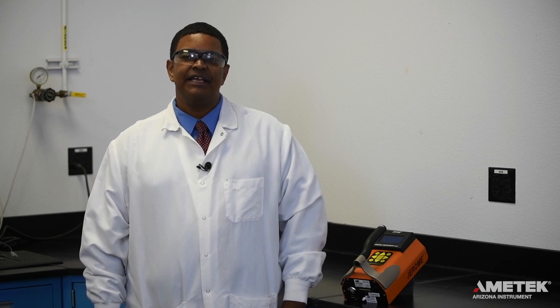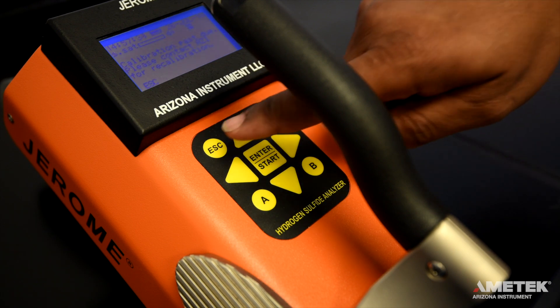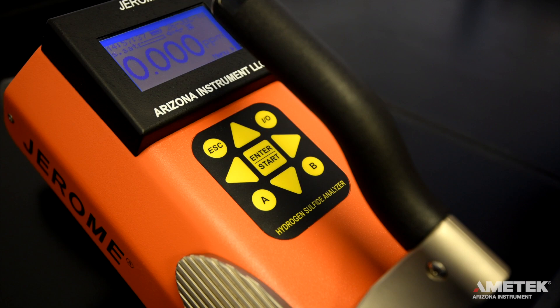After you have verified that you've received everything on your packing slip, simply turn on the instrument by pressing the power button. If any calibration reminders appear, simply press ESC to return to the main screen. The display should read 0.000 ppm. On the main menu, you will see the date, time, battery life indicator, test result, result units, sensor saturation meter, and menu link.